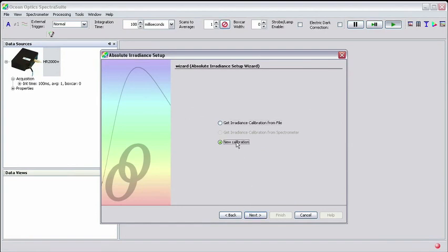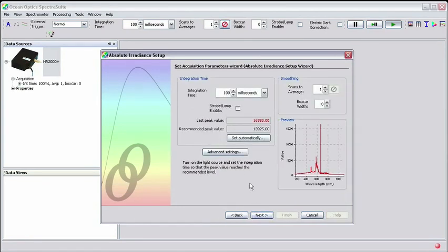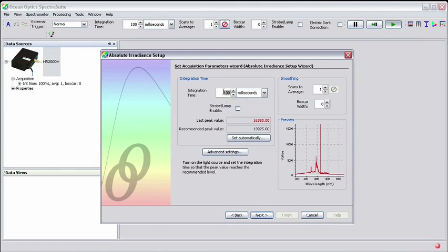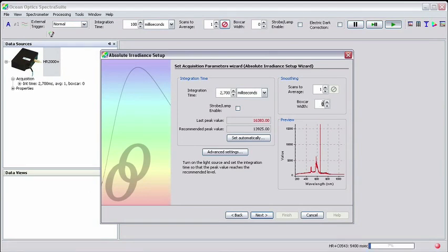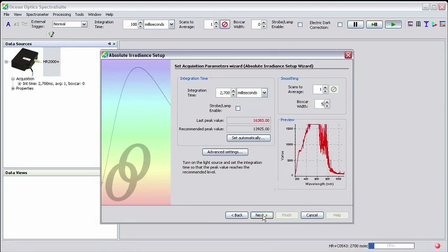Select New Calibration in this window and then click Next. In this window, we'll enter the integration time that we used before. Also, you'll want to set the boxcar width to 5 just as we did before. Add any averaging at this point and click Next.